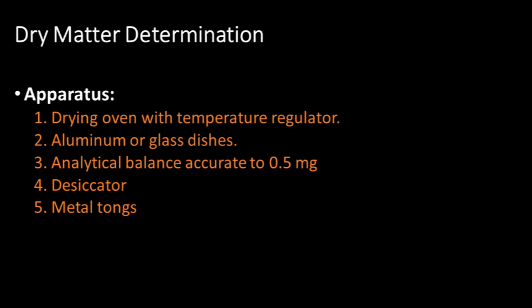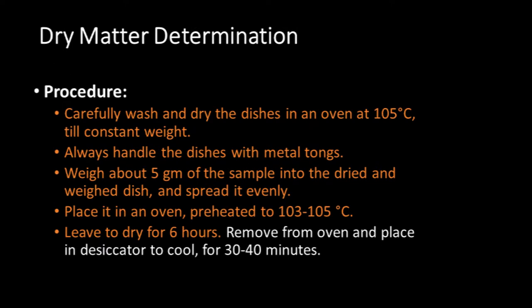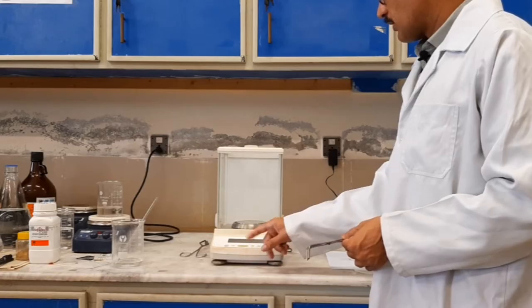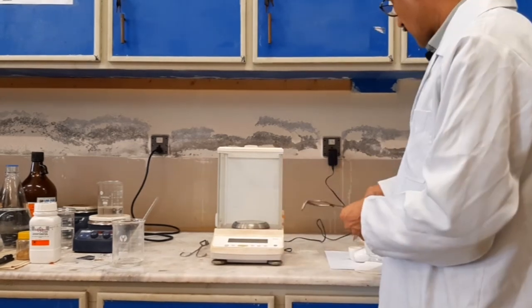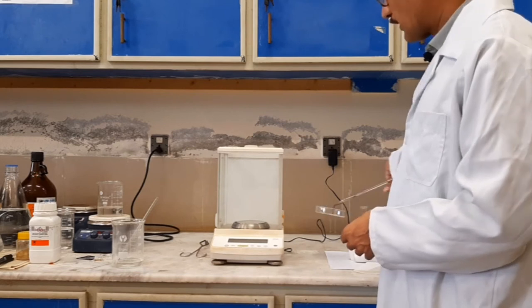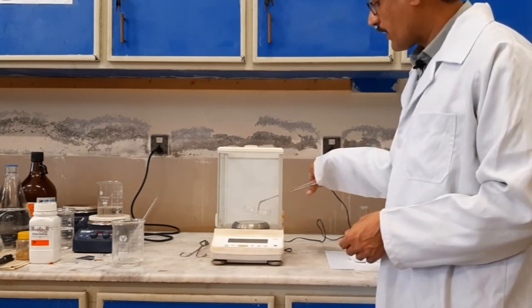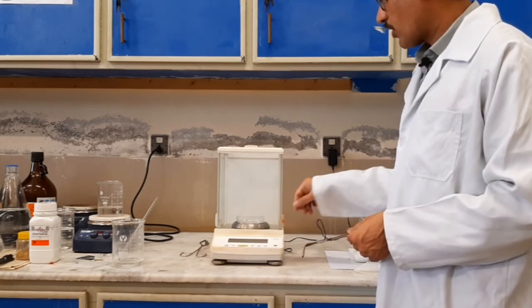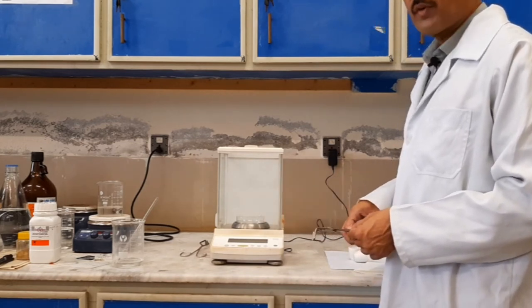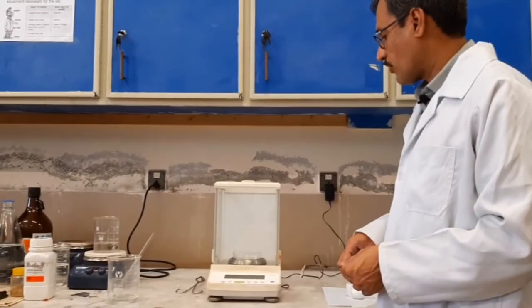Methodology of dry matter determination: Carefully wash and dry the dish in an oven at 105 degrees Celsius till constant weight. Always handle the dish with metal tongs. Turn on the balance, tare it, and then place a clean dry petri dish and weigh. Record the weight. This is the weight of empty dry petri dish.